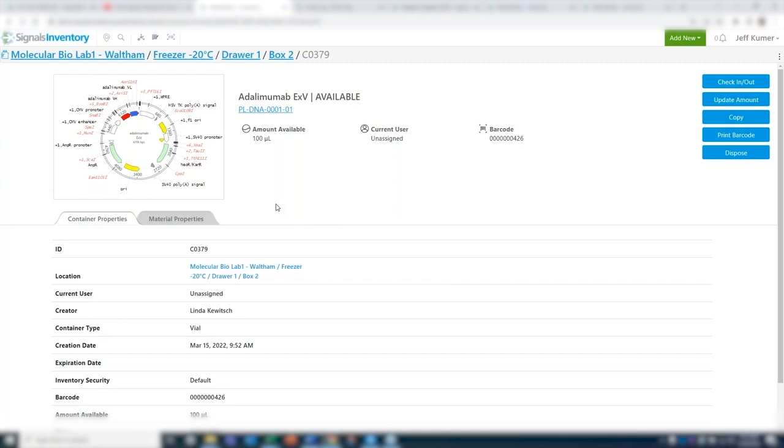The 2D, I believe, is in development, but it's not available at the moment. I think it's on the roadmap. The structure, I don't know, Jinsu, do you know if you can print the labels with the structure and the barcode on it? I don't think you can.